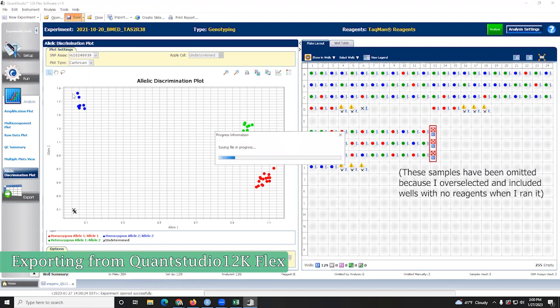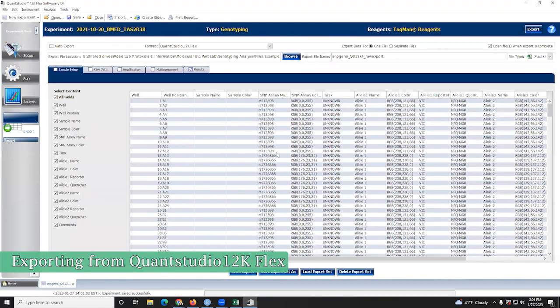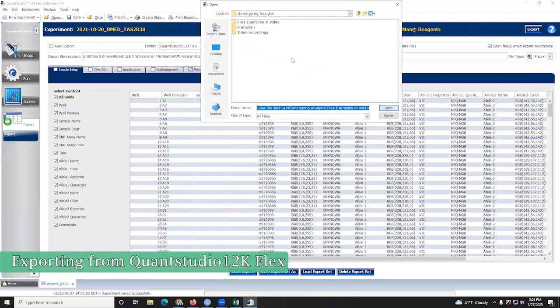TAS2R38 is usually pretty clean, so it's usually not very, very difficult to see if something is desperately wrong. If it doesn't look like a clean 3-part distribution plot, then there's maybe something a bit off. Either you have a weird population that you're looking at, or something else.